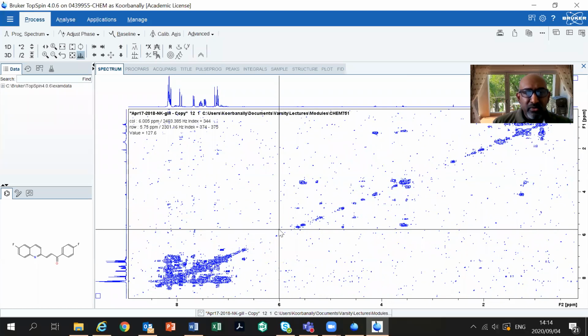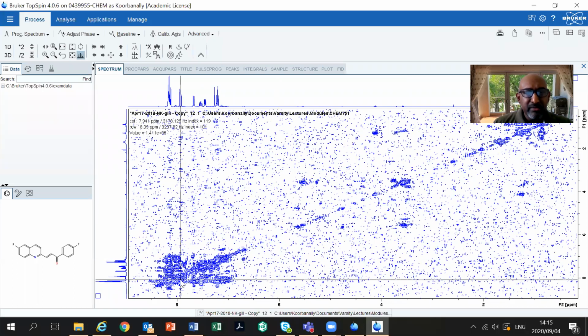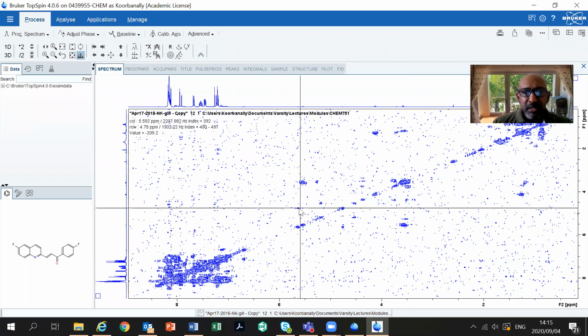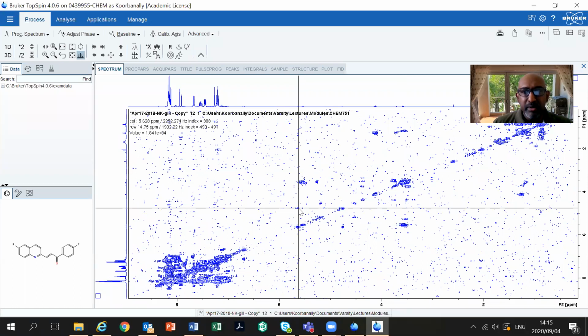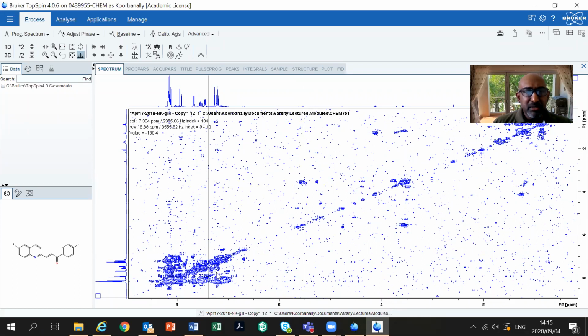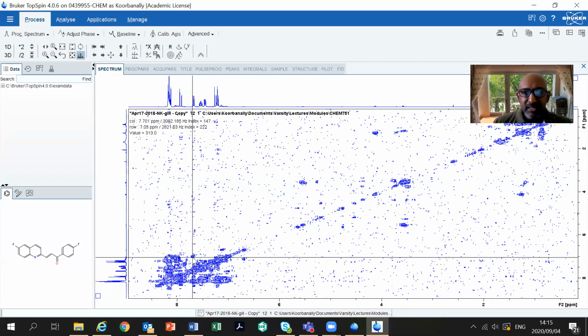And I can even go so far as to say that these peaks here, the ones that are very pronounced, might be peaks of mountains, right? So if I had to compare this one here with this one here, maybe this is a very tall skyscraper, and maybe this is a mountain, right? And maybe this is the Drakensberg, where you have a series of mountains, right? So what I'm actually trying to get at is that each of these are peaks, right?